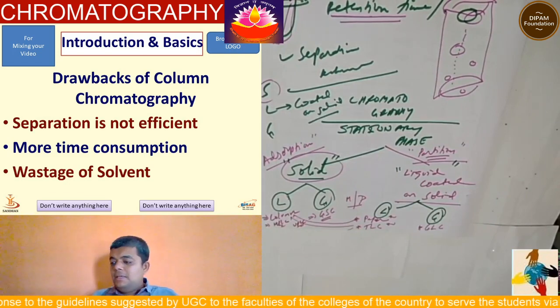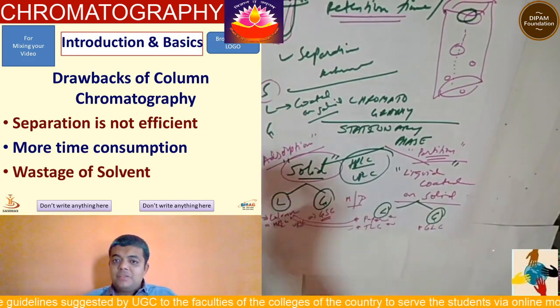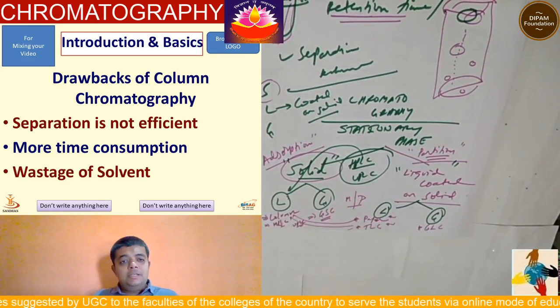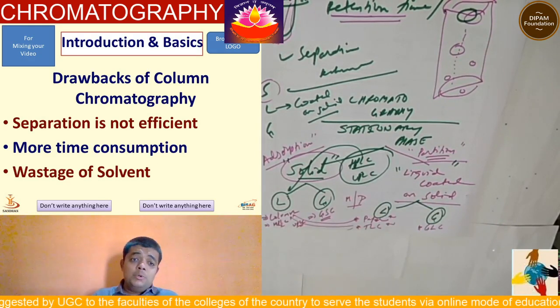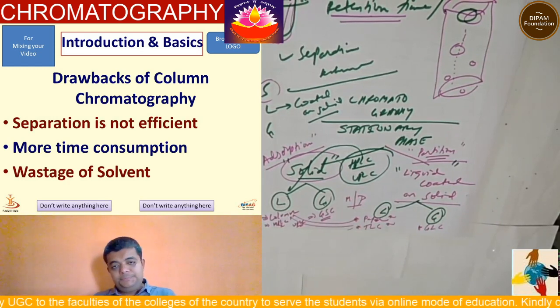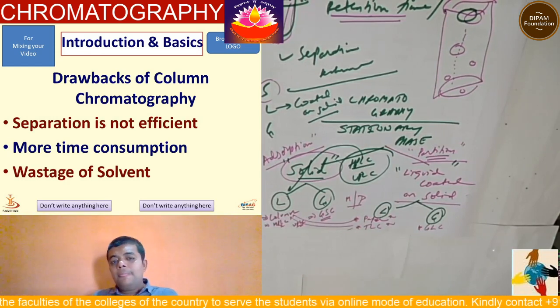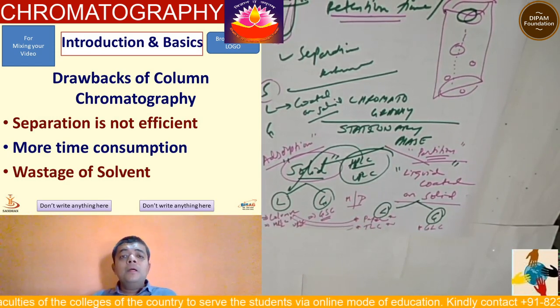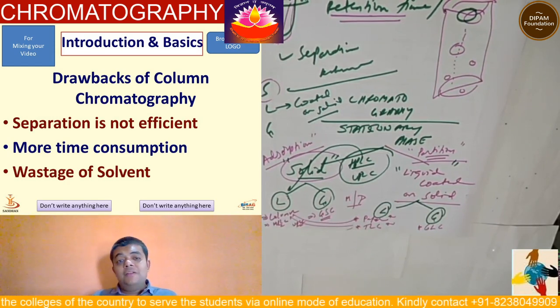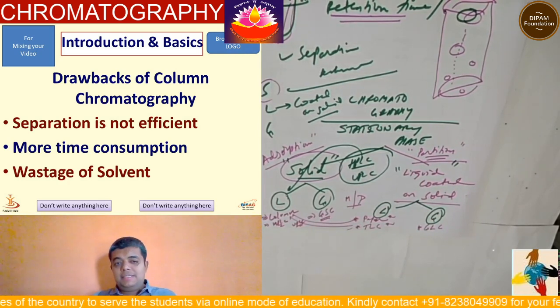And friends, HPLC and UPLC, with specific reasons, can be placed in this category of solid liquid combination using the mechanism of adsorption separation and not the partition separation. So this is how you can classify chromatography on the major basis of stationary phase and the supporting basis of mobile phase, resulting in four different combinations and 7 to 8 different techniques.